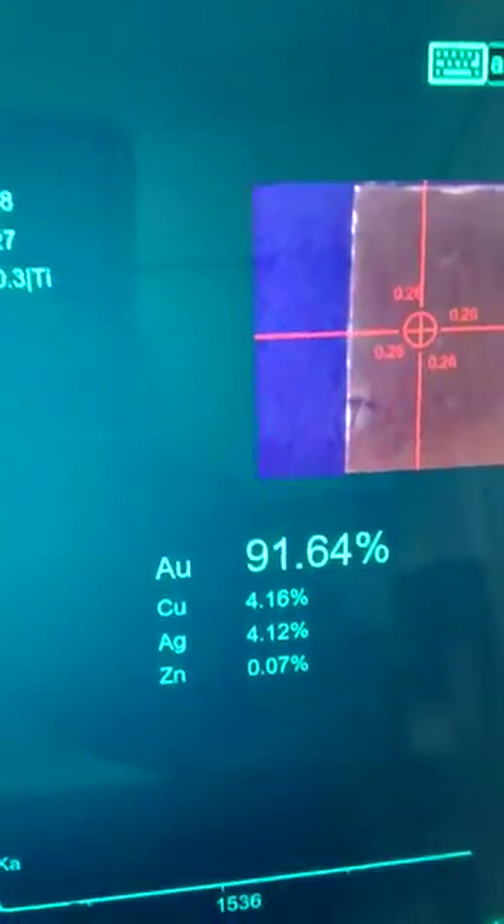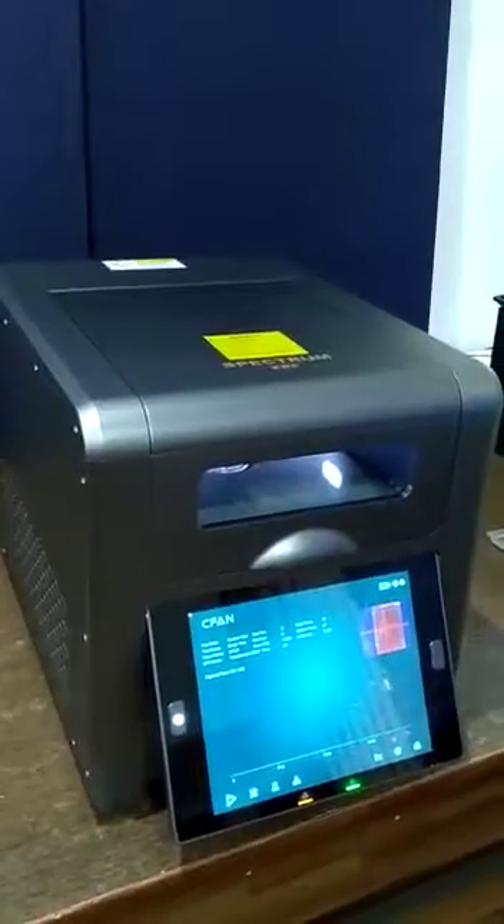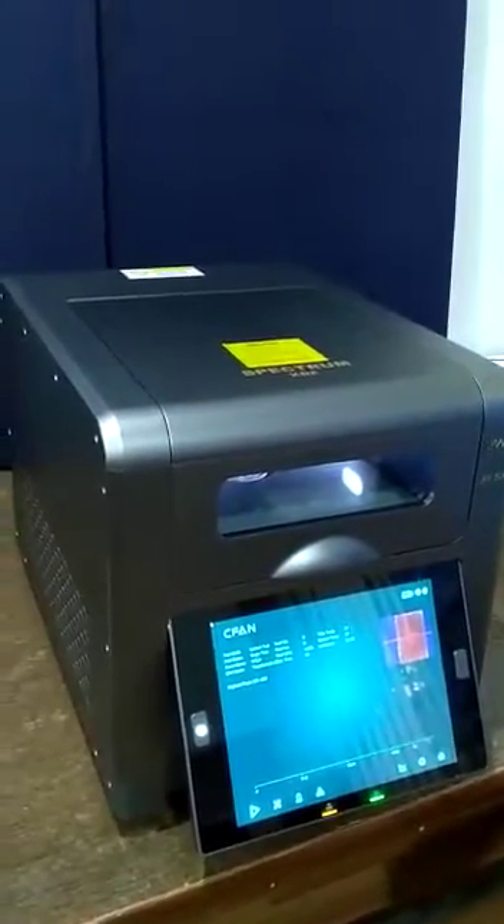This is the sample result. In case of emergency, machine can be switched off by this red button on the backside of the machine. Radiation can be switched off immediately by opening the door.